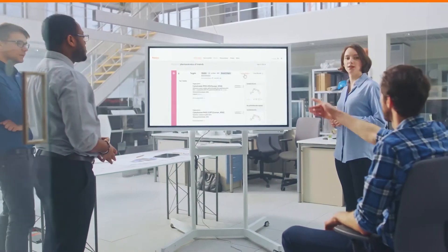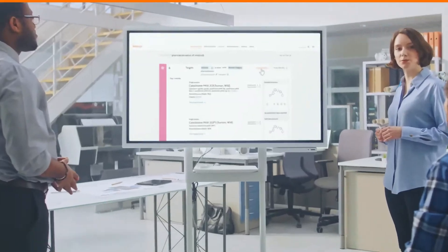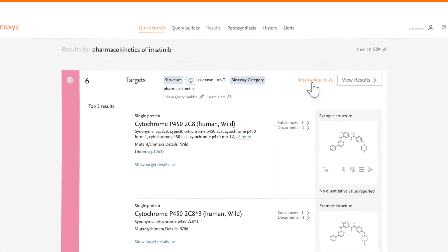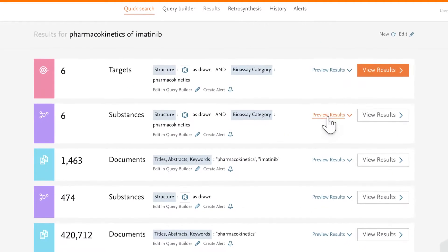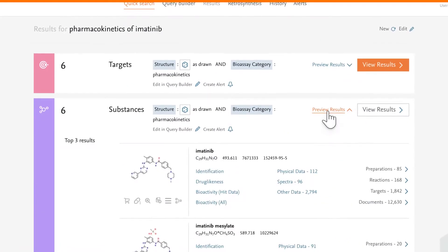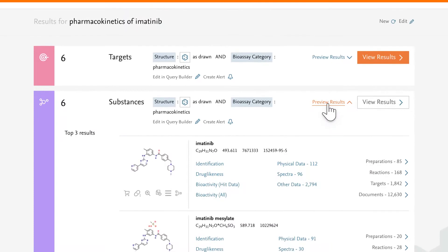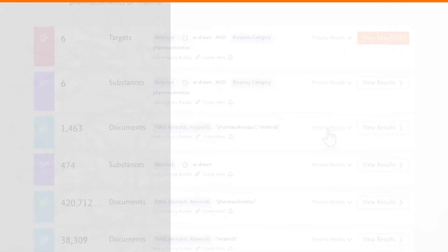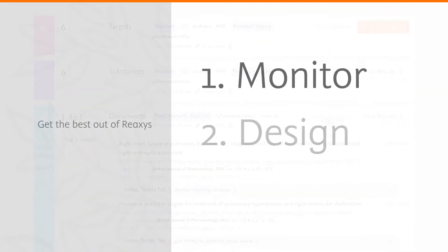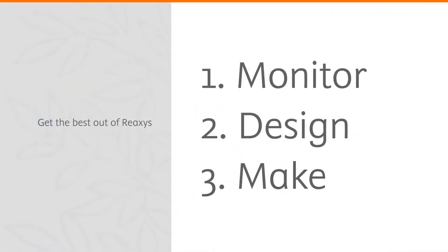With text and structure search options for all your literature, substance and reaction information needs, doing research was never easier. In this video, we'll show you how you can get the best out of Reaxis.